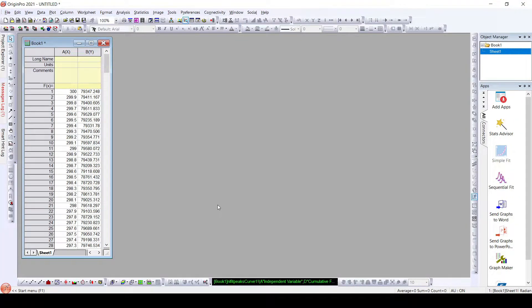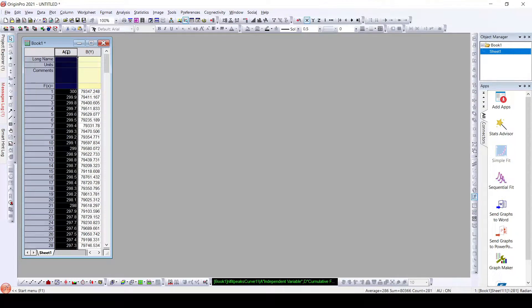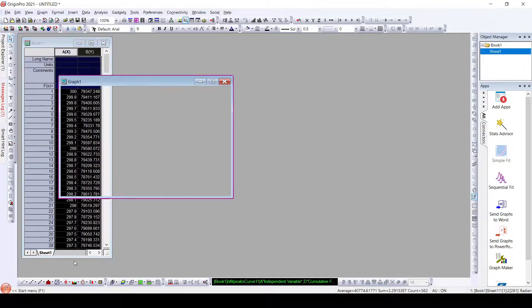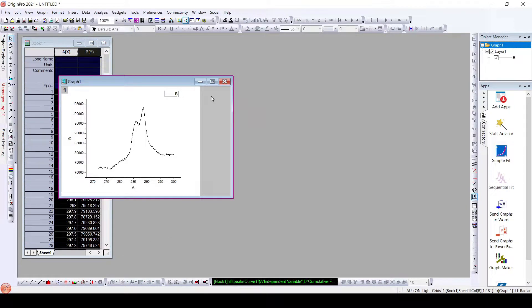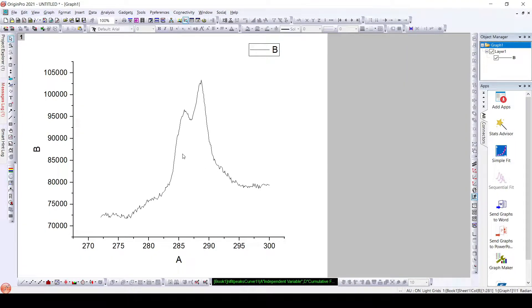Hello everyone, today we will learn to deconvolute XPS data. Here we will plot this XPS data. We can see there are two peaks and we need to deconvolute them or separate them. For this, first we will subtract the baseline.